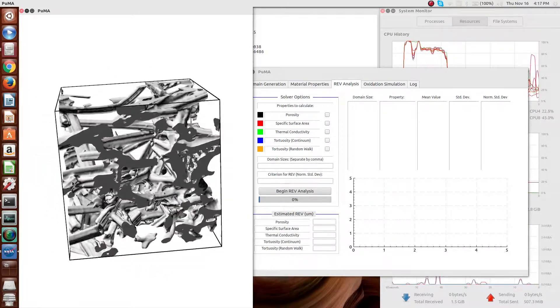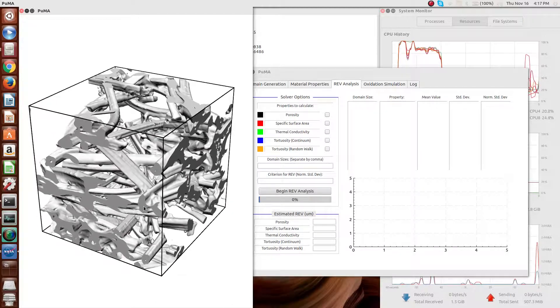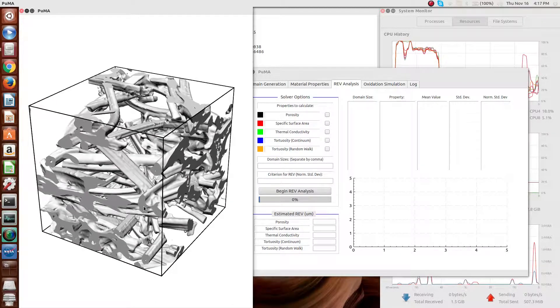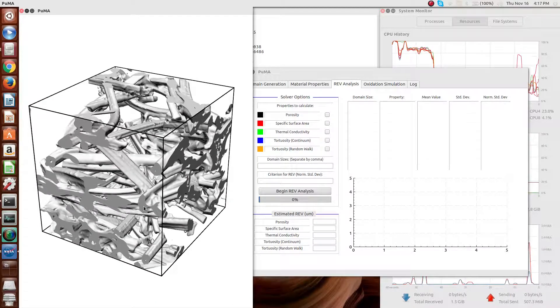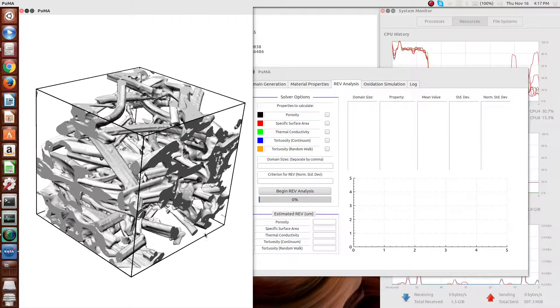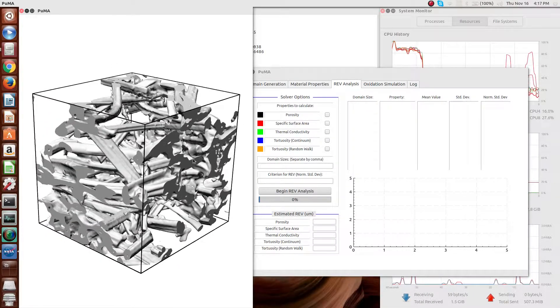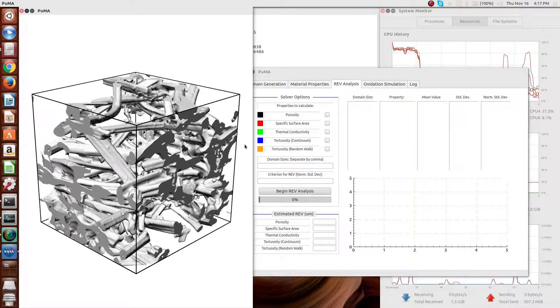Typically, for the carbon fiber materials like this, in order to get a truly representative volume, you're talking about something on the order of a millimeter cubed. This is maybe about a tenth of that, or a little bit more than a tenth of that.